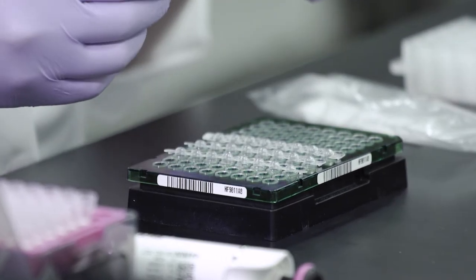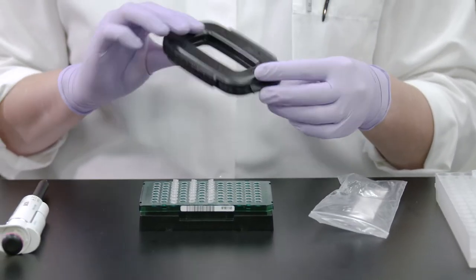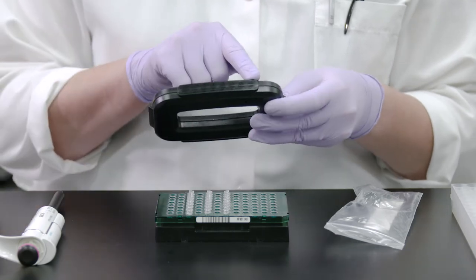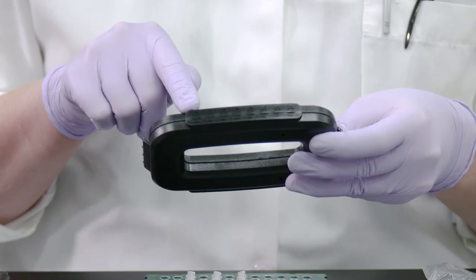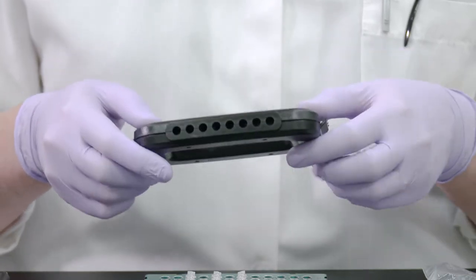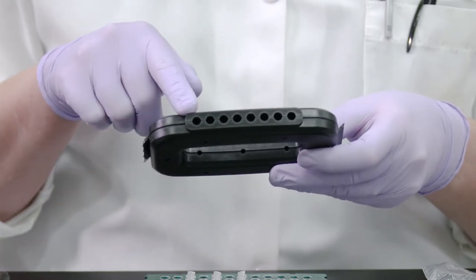There are two sides or surfaces of the capping tool. For flat cap strips, use the flat surface side of the tool. For domed caps, use the surface with holes that align with the domed caps.